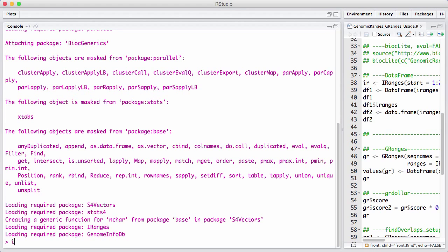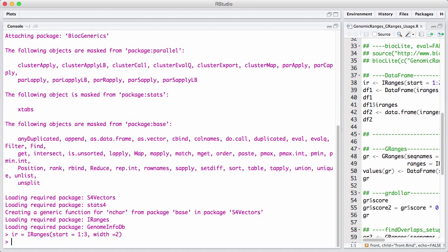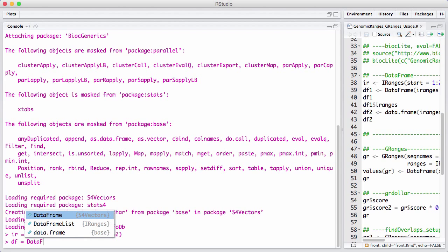Why do we need a new class for this? Let's take an example and construct an IRanges and a DataFrame — capital D, capital F. It works like a classic R data.frame, but it allows objects of arbitrary type, as long as they have a length attribute, to be stored in them. For example, it allows you to store IRanges inside them.